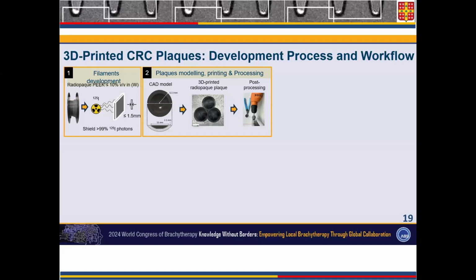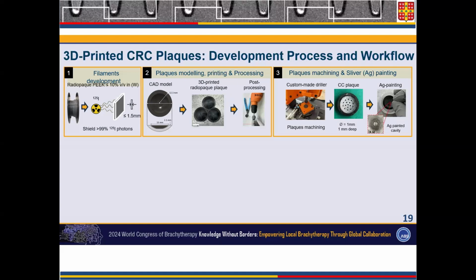as the radioactive component. The CAD model, the 3D printed plaque, and the 3D printing strategy were developed, followed by the development of a dedicated bench for drilling the little holes that are used to place the radioactivity in the plaque. This is a strong contribution from Théophras Lescaut, research associate in my lab. We developed this little machine tool that is very close to what the watchmaking industry in Switzerland does, so we clearly inspired ourselves from the watchmaking industry.